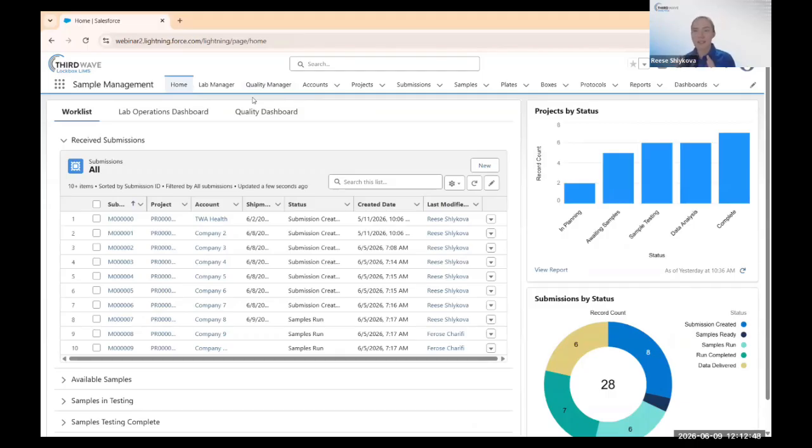And so before I go into detail on those, I do want to ask a simple question, which is, where can your users see these reports and dashboards? Where can they access these from? And so, very simply, there is a reports and dashboards tab, and that's actually where you would go to build the reports and dashboards. Now, I've got those tabs right here, but I do want to highlight if you're looking at your Lockbox LIMS instance and you don't see them, that's not because they don't exist, they just might not be on your particular app.